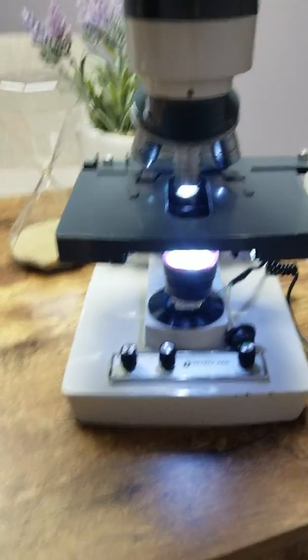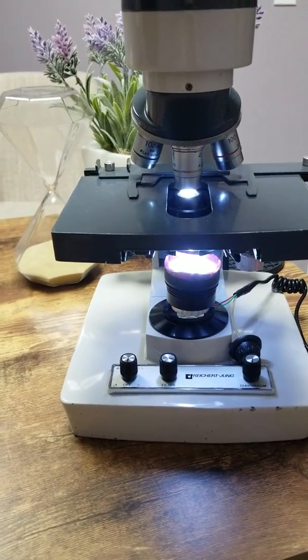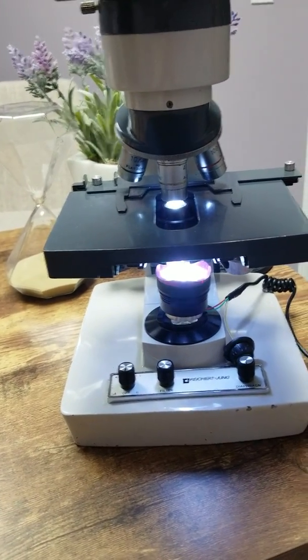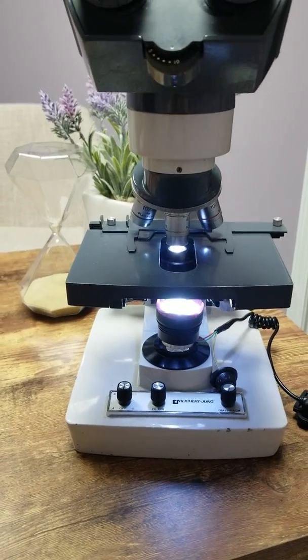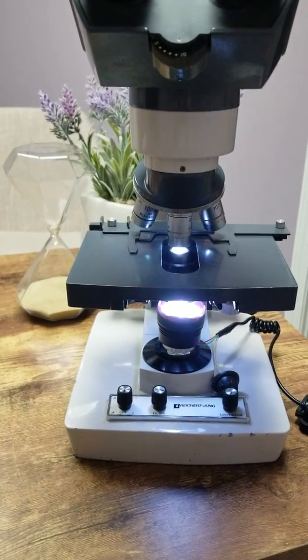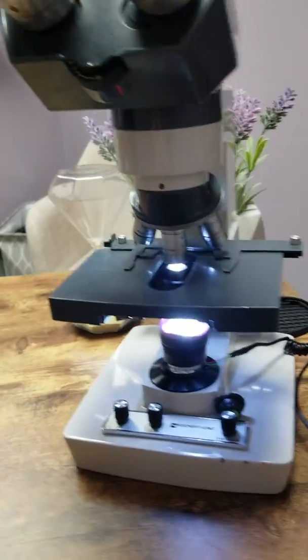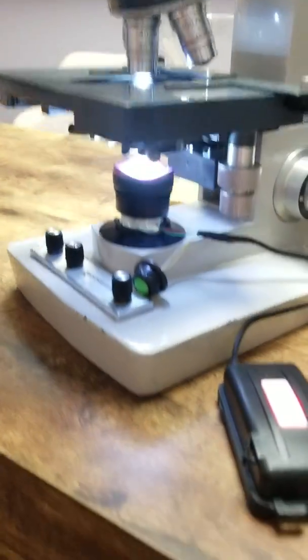It took me like three weeks to get this done. But hopefully—and I couldn't find any information to help me do this. It was just bits and pieces here and there. So hopefully this setup helps you guys out.